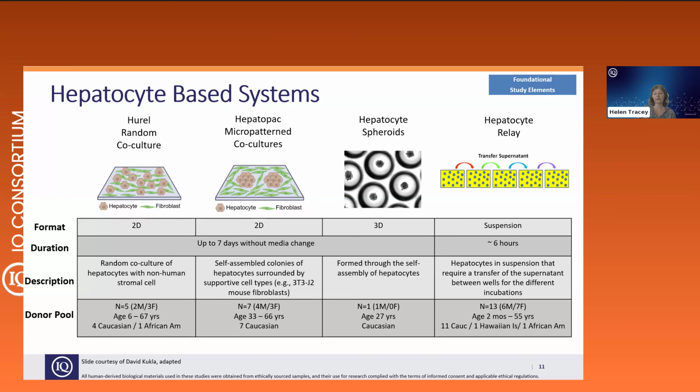And collectively, these differences may have contributed to some of the intersystem variability we saw in our results through demographic effects on expression of CYPs or potentially other DMEs, for example, age-related differences, presence of polymorphisms. And this is just something to bear in mind while Chuck's discussing our case studies later in the presentation. Next slide, please.